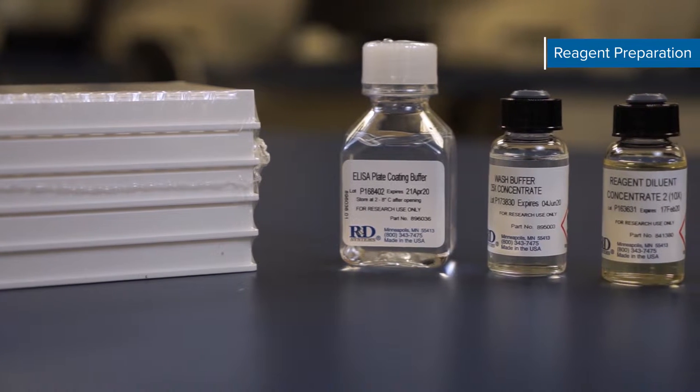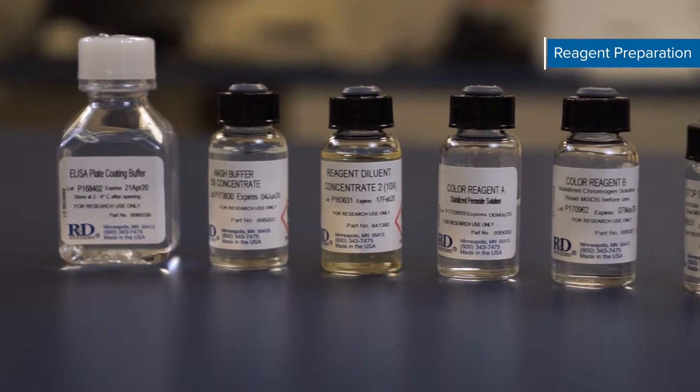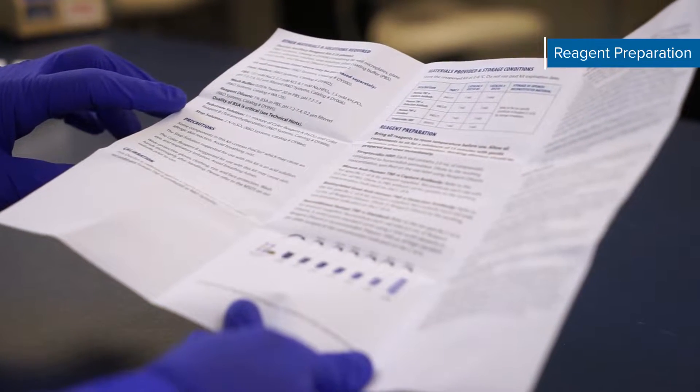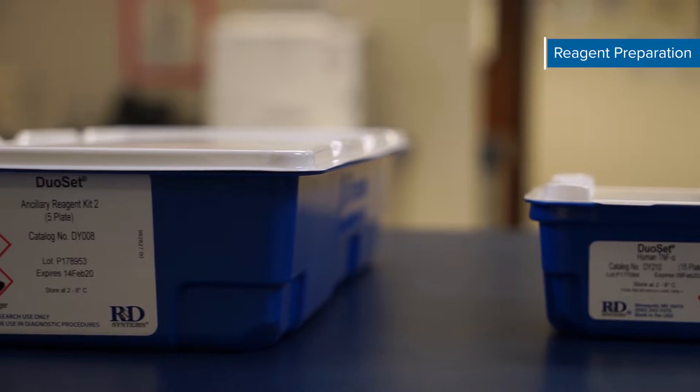Begin by preparing reagents. First fully equilibrate all reagents, buffers, and lyophilized vials to room temperature. Buffers and other materials required are listed on the assay insert. Recommended reagents can be found in the assay insert and on the supplemental products tab of the products web page.